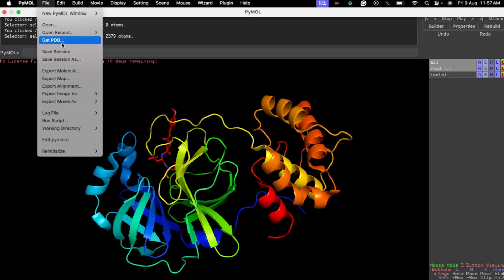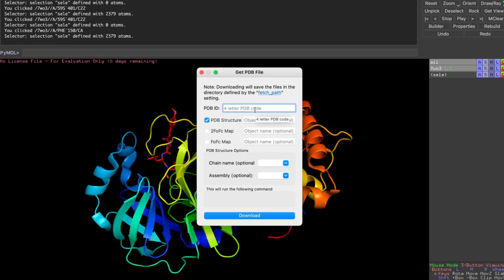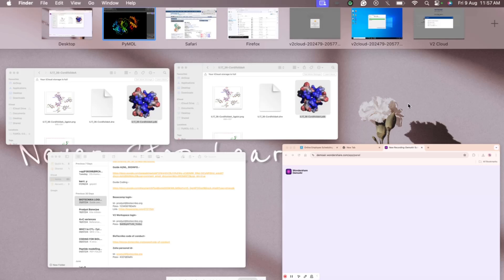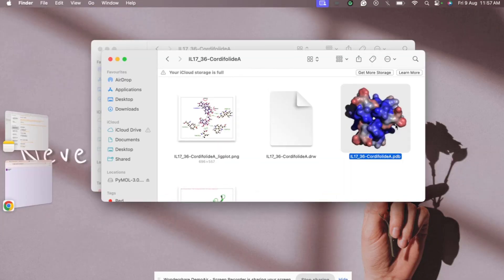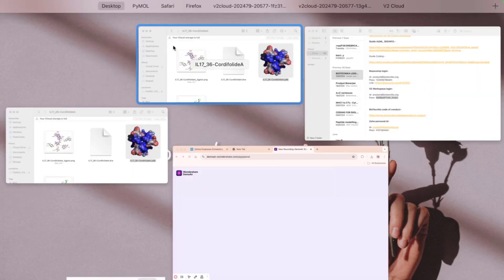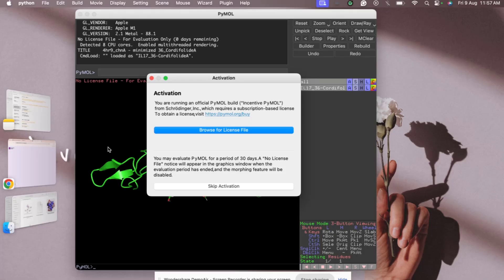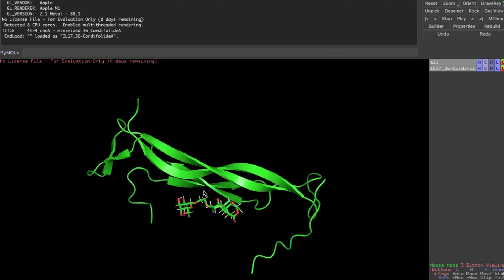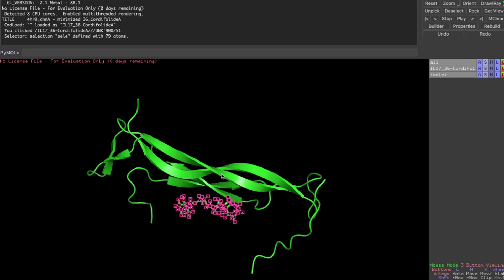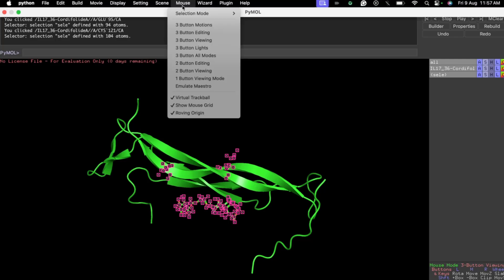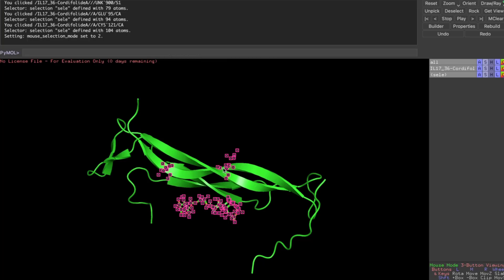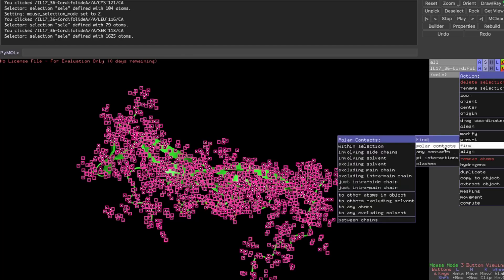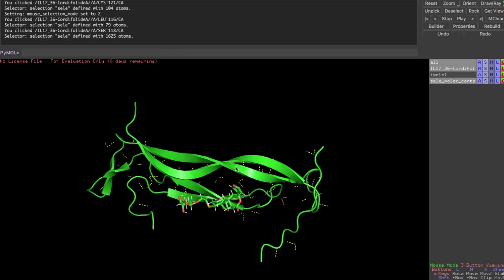Another way to load a structure is through File > Get PDB, where you type in the PDB accession ID and hit download. Let me also show an example with a docking result. Double-clicking on a docking output file opens it in a new tab. I can select both molecules, change their colors, and by default it shows residues, but you can switch to chains.